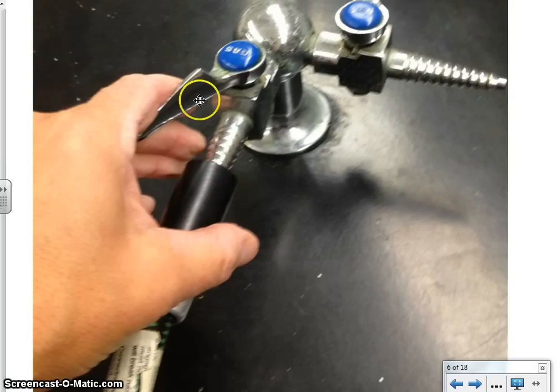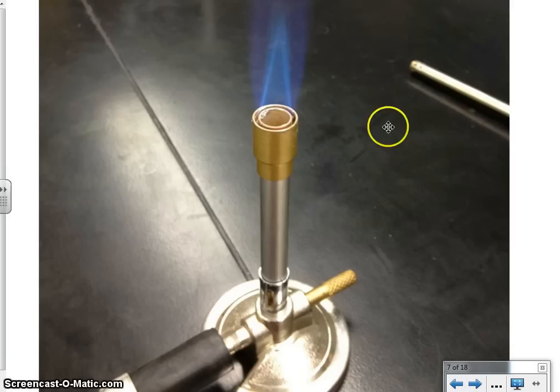Full off is when this handle is pushed back either in this direction or pushed back all the way in the right hand direction. But you'll turn the handle so that it is close to the gas jet, and at that point the flame should ignite. It should look something like this. You should see an inner blue cone and then an outer blue flame like so.